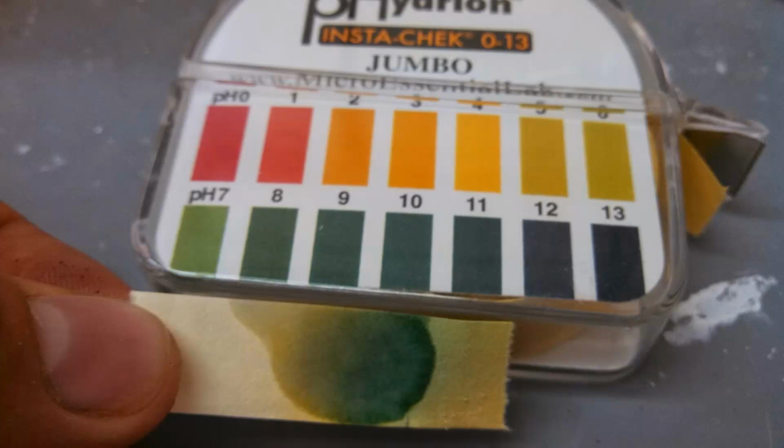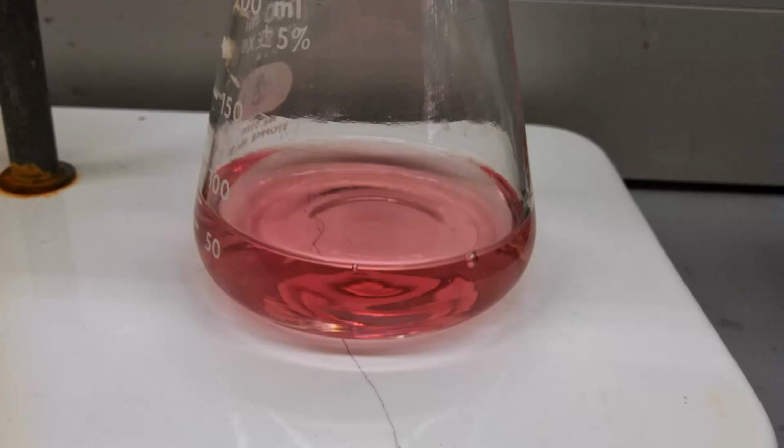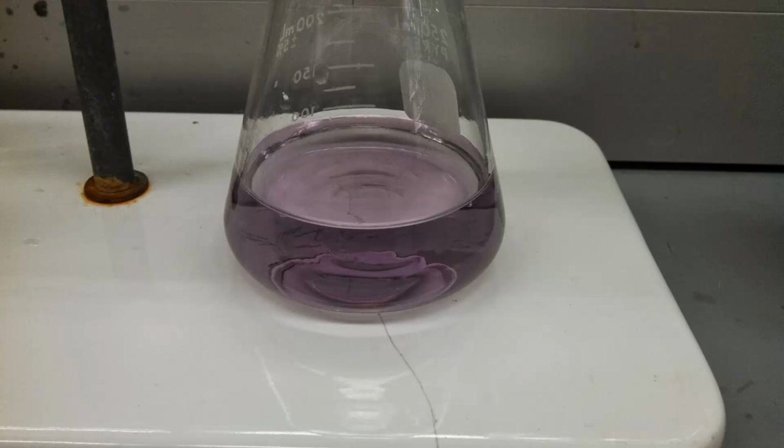So when you have your primary standard solution, you'll pipette into a 250 milliliter Erlenmeyer flask. You'll add the Calmagite indicator, and it will look like this. This is the wine red color that you should be expecting. As you add EDTA to this, the red is going to be removed and replaced by blue, free Calmagite molecules. And so in the transition between all red and all blue, you're going to get purple. It'll start out as a dark purple, and it'll transition to this light purple.